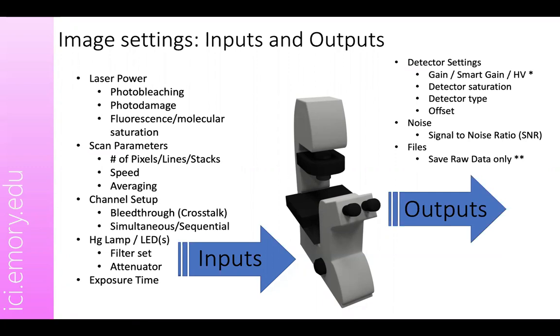And why should you save things as .nd2 files or .lif files and so on? That's because all these files also integrate the metadata along with the images, right? So the metadata is crucial at the end of the day. It helps you understand what kind of imaging parameters you had used. You can always convert your ND2 or LIF file into a TIFF file using Fiji. So don't worry about TIFF file, and never ever use JPEG as a way to save your files, right?